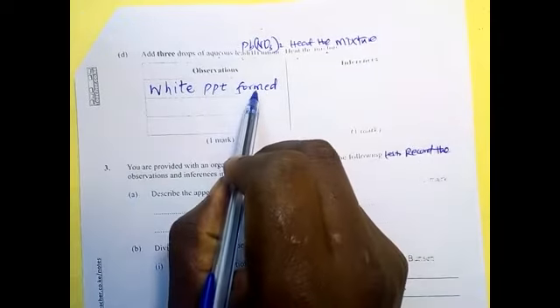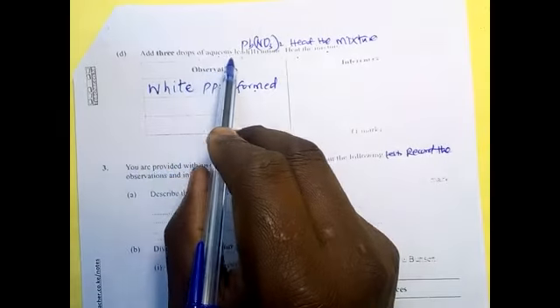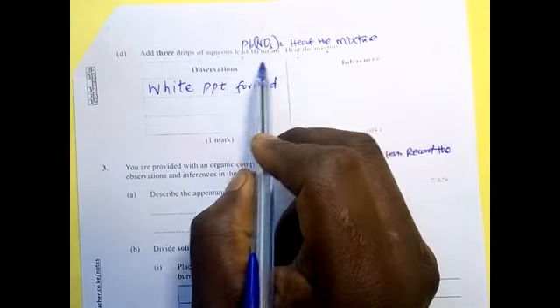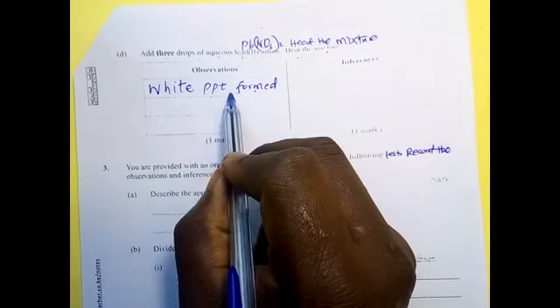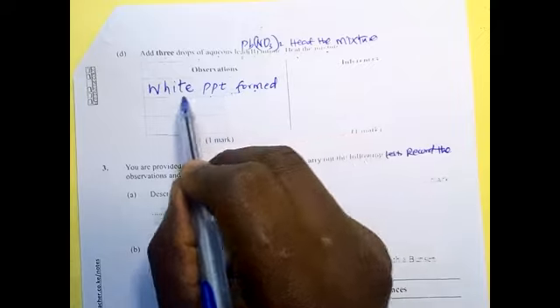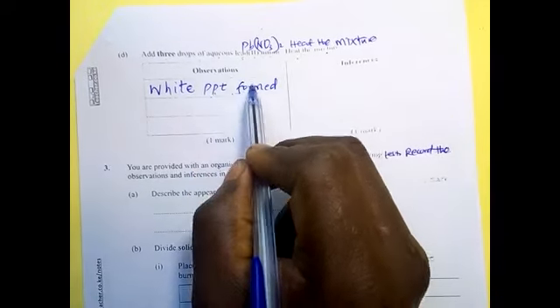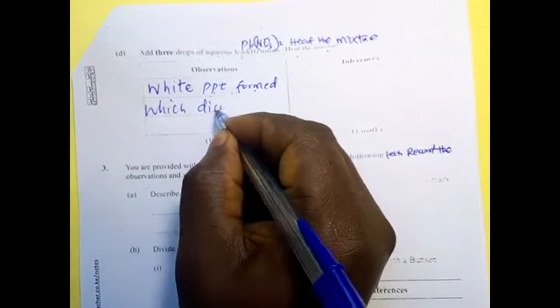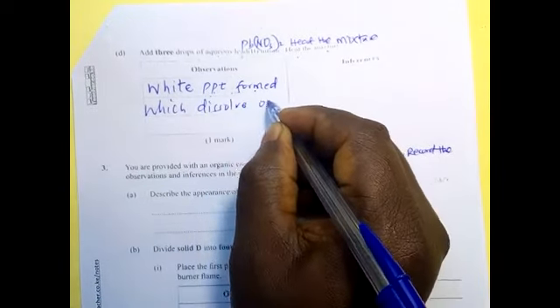The observation we have made is for adding lead nitrate. After heating, what happened? Did the white precipitate dissolve on heating or not? That is the second observation: a white precipitate is formed which dissolves on heating.